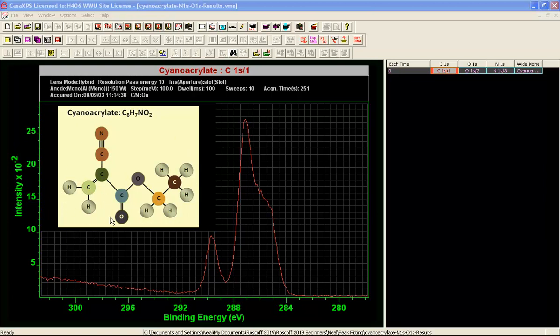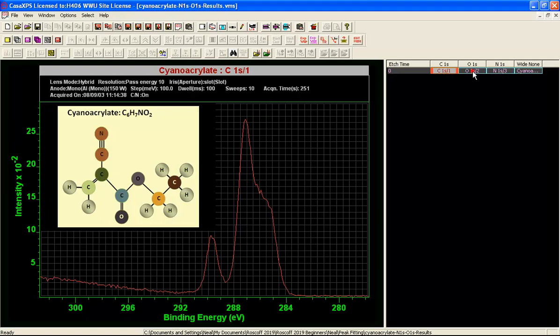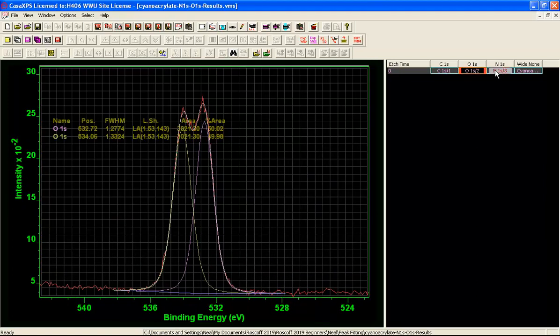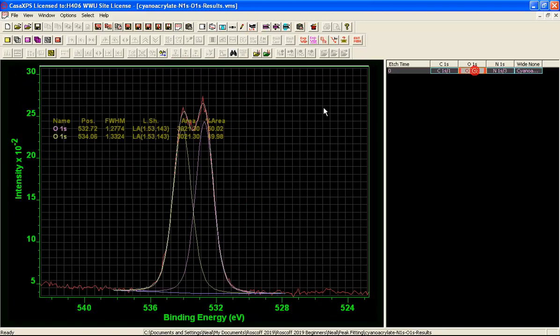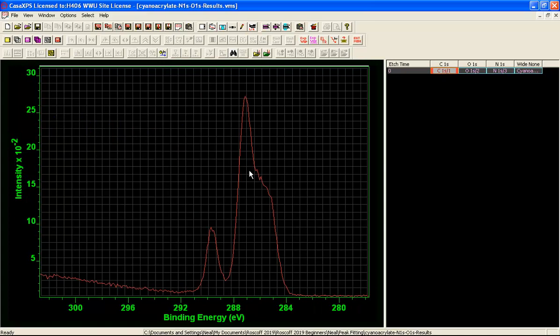So we anticipate that the oxygen appears as a pair of atoms against a single nitrogen and we think there should be 6 carbon atoms, at least there may be 6 carbon atoms, contributing to this envelope we see here. Well the oxygen and the nitrogen both conform in the sense that we have got a single nitrogen peak for 2 oxygen peaks so we might expect 6 carbon peaks here.